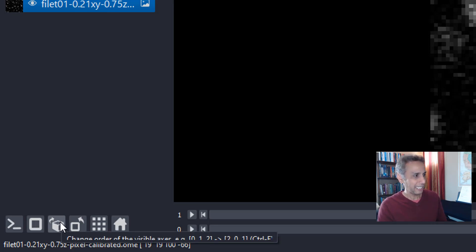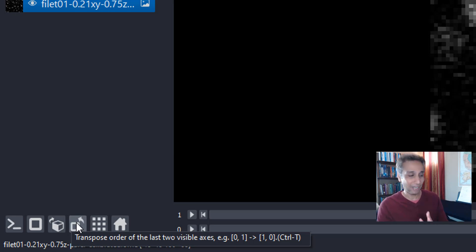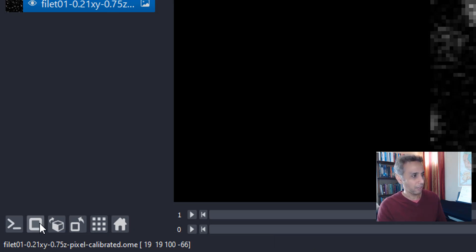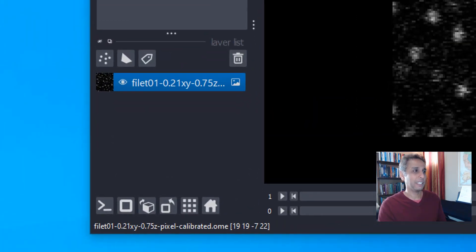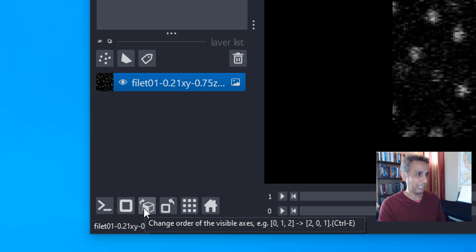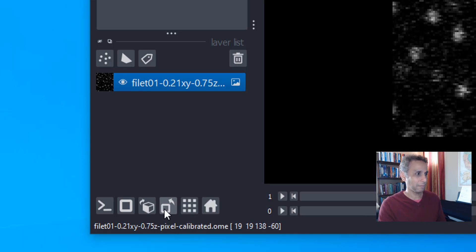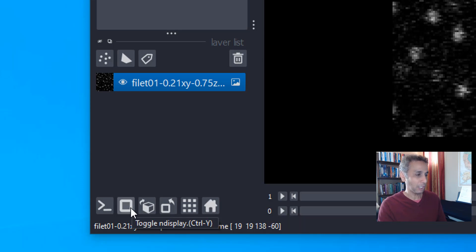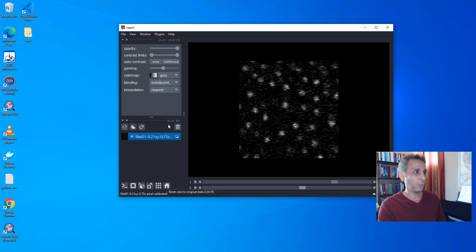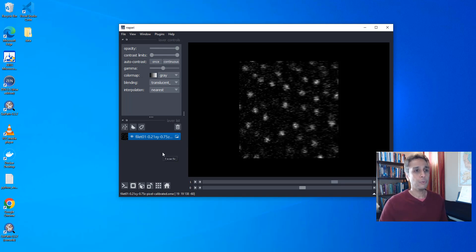And I believe this button right there, this is where you can toggle the display between 3D and 2D viewers. And I can see this. And there seem to be some design aspects that need to be fixed. You can see when I hover my mouse over, down there it says transpose order. You can clearly read it. But when I move the mouse to the next element right there, I cannot read it. I cannot read what's going on. Let's resize it and let's do exactly the same. So here I cannot read it. Now I can read this. Something funny going on. I don't know what. Because previously that was tough to read. So there are maybe a few things from a design point of view. This looks okay. But in general, of course, for what it does, minor design flaws and it's free, open source. Come on. It's only going to get better.